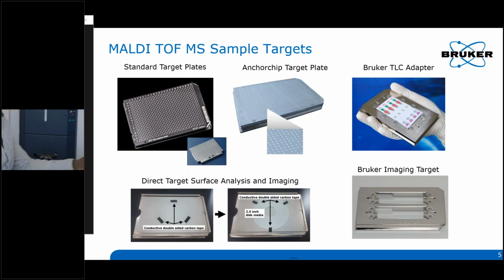Pretty simple. So that was our standard target plate. It comes in two sizes: this standard one and a smaller one that's used on a microflex.